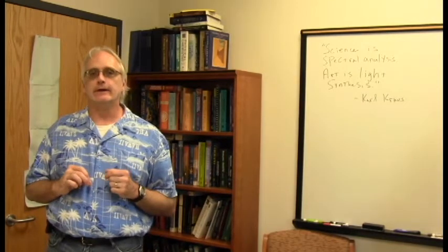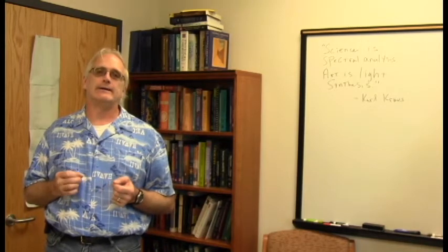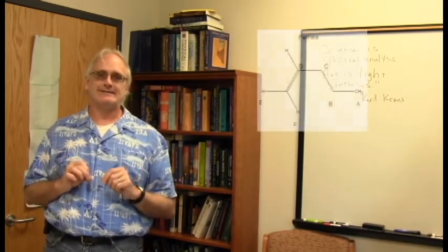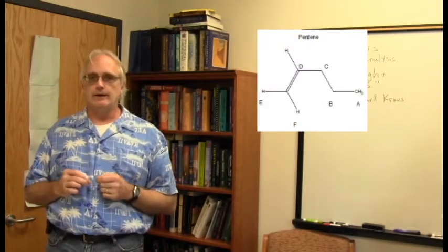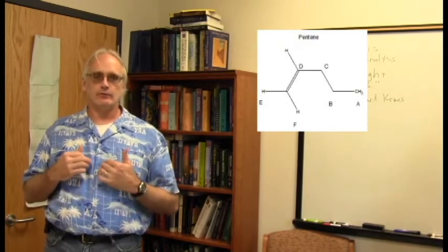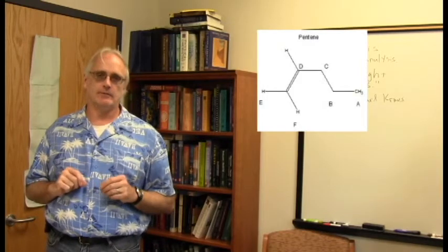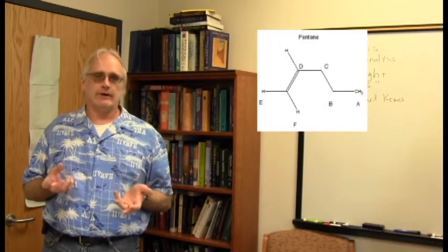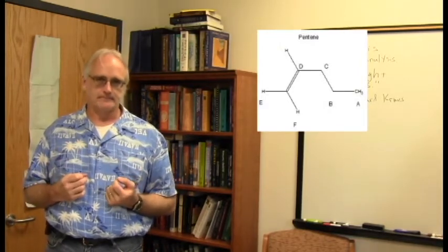What I'm going to show you then is the homonuclear decoupled version of the pentene spectrum, where we decouple at group C, right around 2 ppm. So this is the one that is being decoupled. This is the group that is oscillating between its spin states so rapidly the remaining protons in the molecule only feel its average effect. In other words, we acquire a spectrum as if group C were not even there anymore.